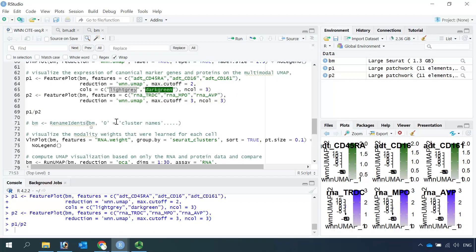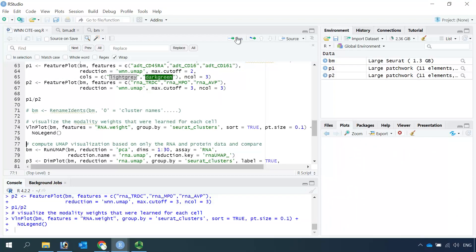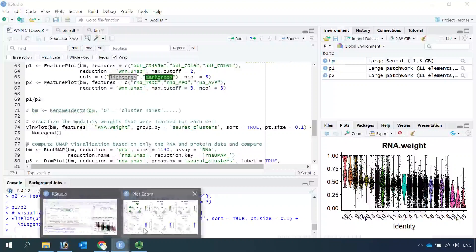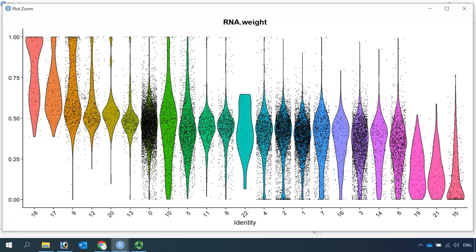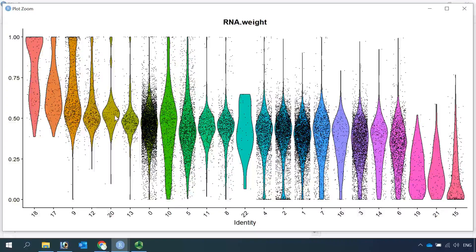Next we can visualize the modality weight for each cell from the weighted nearest neighbor analysis. We use the violin plot to see the modality weight for each cell cluster. Zooming in, you can see cell clusters on the left side have high RNA weight, and cell clusters on the right side have high protein weight. We know cells in those clusters are progenitor cells in the bone marrow, because in this study they didn't use antibodies to label progenitor cells. According to the online tutorial, cluster 15 is T cells, because it has the highest protein weight.